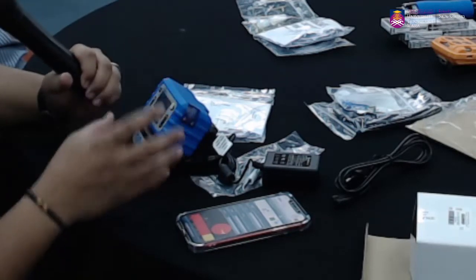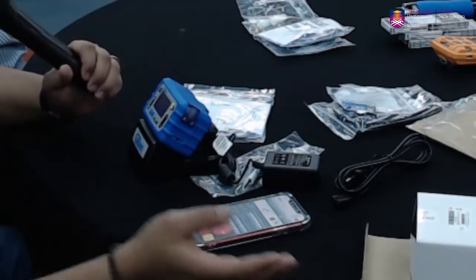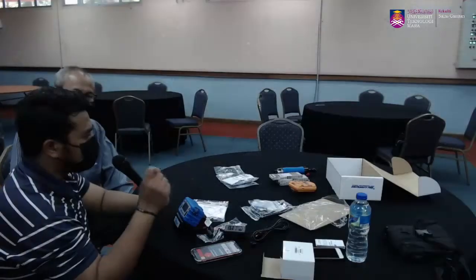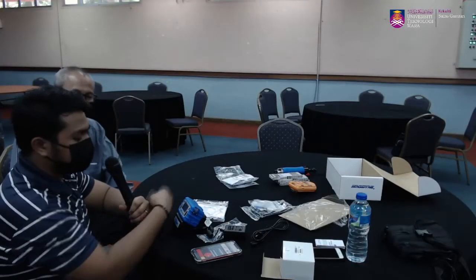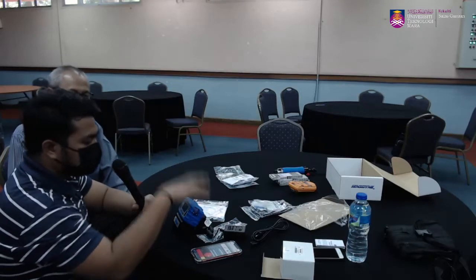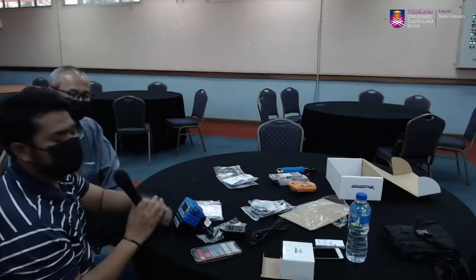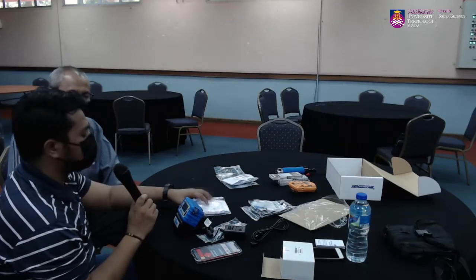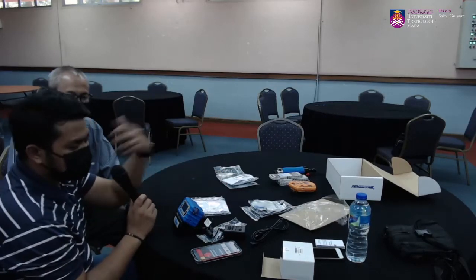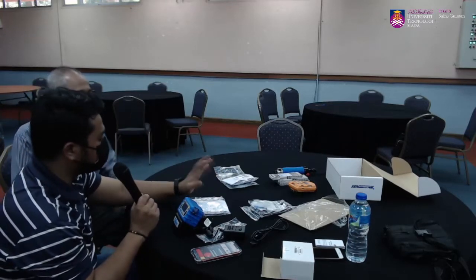So kalau contohnya the SOP, standard operating procedure, is that make sure kita charge lah before kita pergi kat site. So at least benda tu is fully charged and kita tahu only one person is handling the charging lah. So tak ada apa-apa barang yang hilang. So kalau contohnya student nak pinjam pun, in terms of daripada pump sahaja, pump and accessories untuk connectkan kepada filter media lah. So itu daripada situ kita kena identify betul-betul in terms of apa yang dia nak pakai dan apa yang dia perlu untuk bawa ke site. So kita risau nanti bila dia bawa balik ada satu dua benda yang hilang, so and then kita pula akan kena terpaksa replace benda tu.